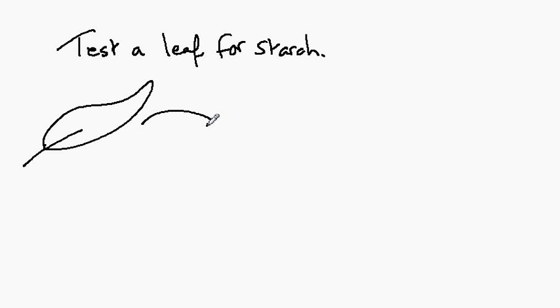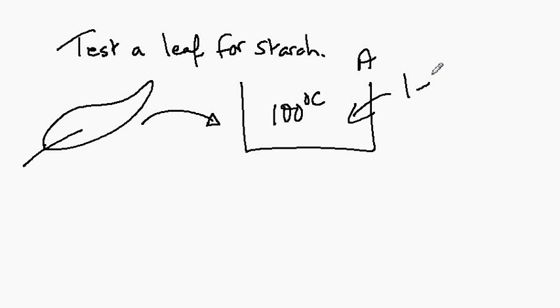Then I want you to transfer your leaf to the water bath. I'm going to call this water bath A. This is the hot one. It's going to be as close to boiling point as we can get it, and it shouldn't really stay in there for more than one to two minutes.